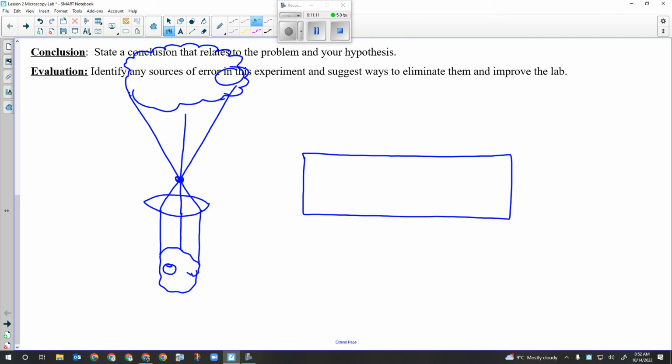Okay, so you're going to have this small piece of paper, okay, and on it will be a small lowercase letter E. Okay. What you will do is you will take that and you'll put it on the slide, like so. Then you'll take an eyedropper, okay, and there'll be a bunch of eyedroppers and a beaker of water on the front table, okay, and you'll put just a couple of drops, 2 at the most, okay, 1 is often good enough, onto the letter E.